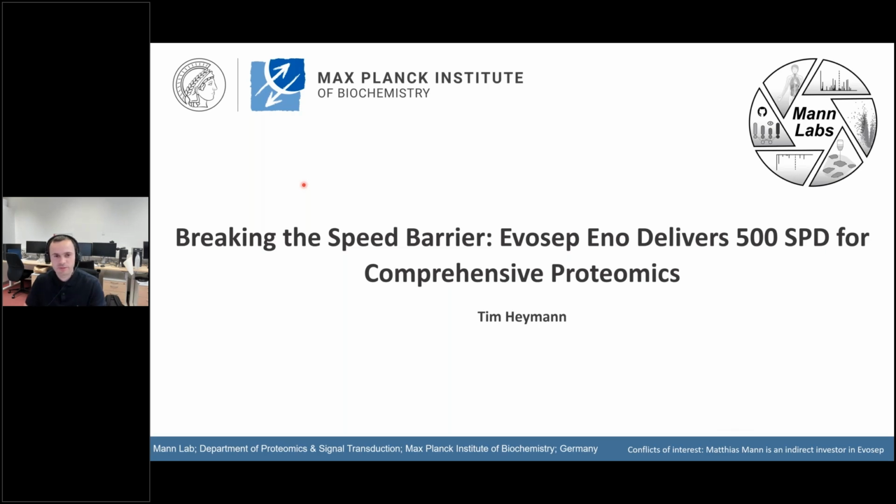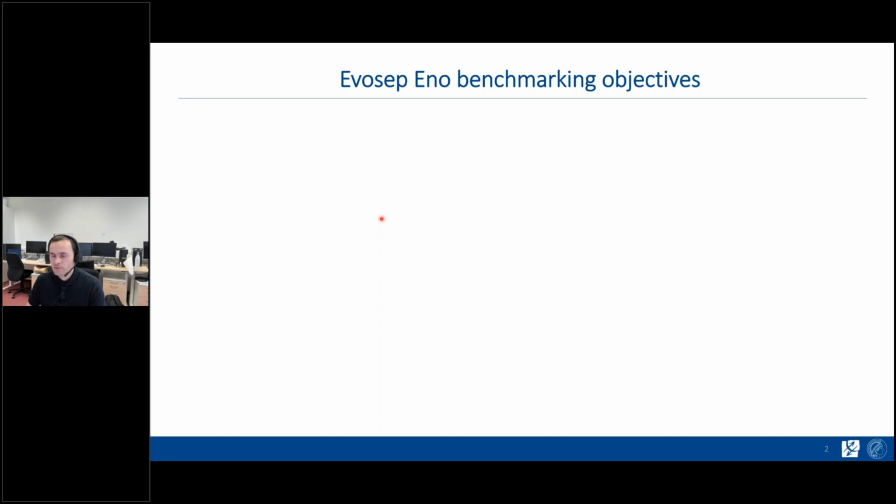I'll be talking mainly about applications with Evosep ENO at high throughputs at 500 samples per day. Let me give you a brief overview. So once I got the Evosep ENO, I had a couple of benchmarking aims.